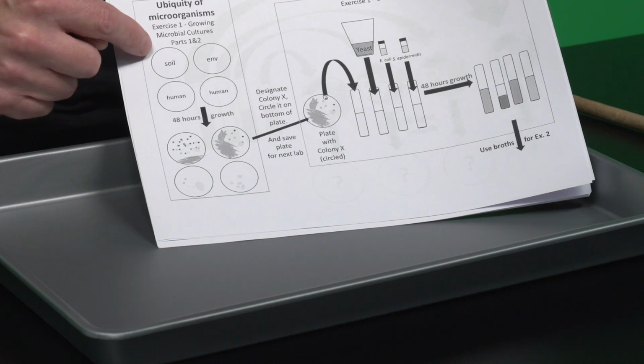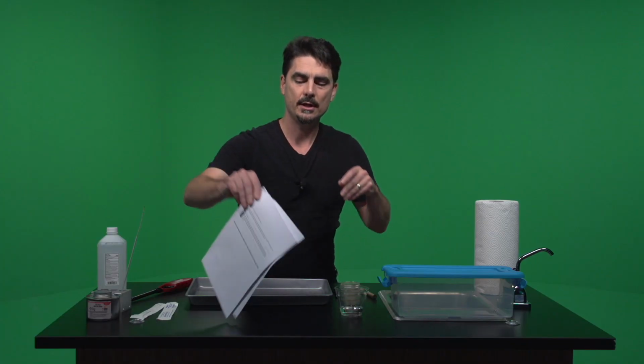Basically I am requiring you to do a soil sample. The reason is that there's a lot of microbes in the soil, and you're guaranteed to see some interesting stuff.